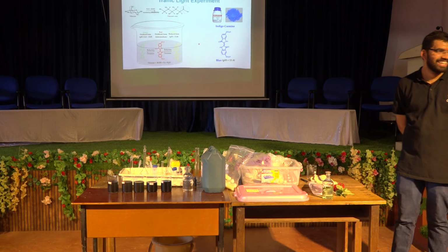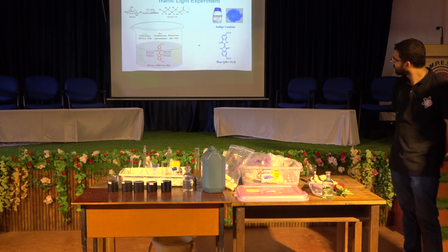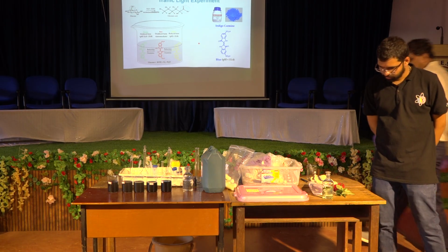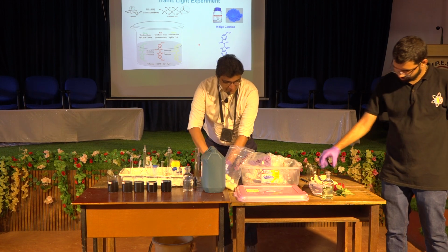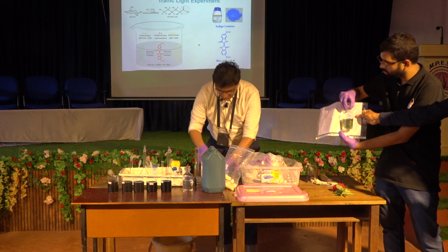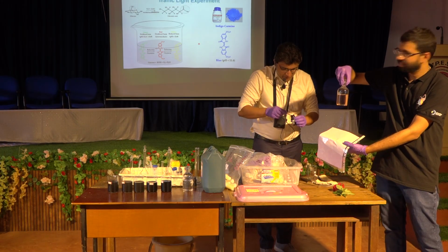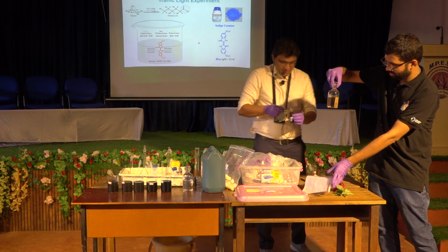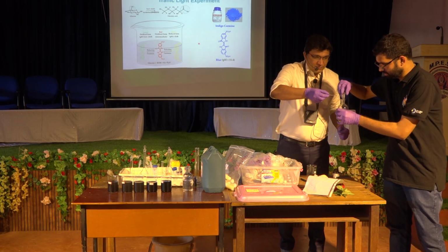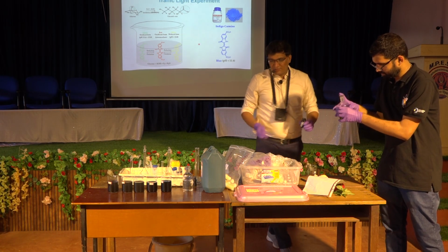Okay, so if you see, the green color has not appeared. It is turning into yellow. We can use some white sheet at the back. One minute. You observe carefully here. Can you see now? That is turning colorless or faint yellow. Can you add a little bit more indigo carmine? No, where we can see the concentration. Can you open this? High concentration. Check it. Once it becomes green, then it will show.